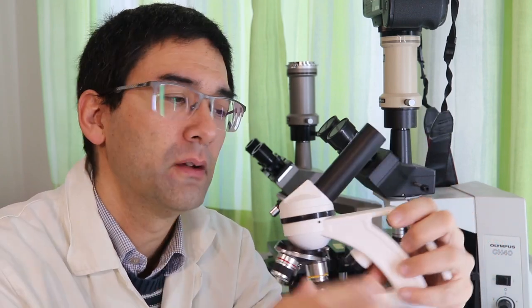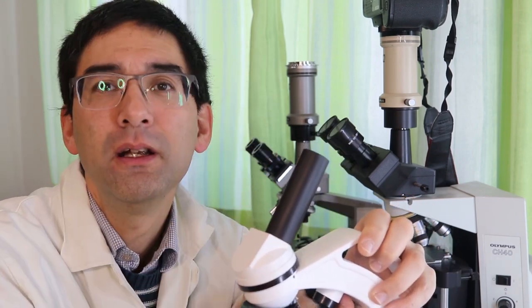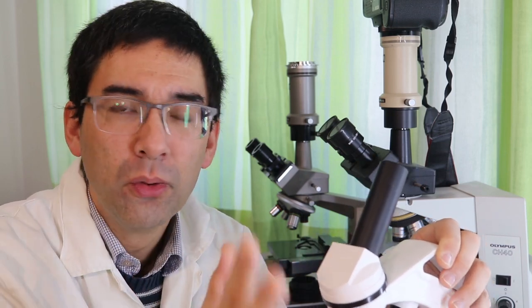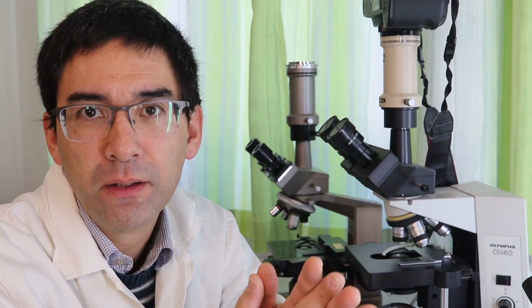And the other thing that is a little bit of a curiosity, I have to admit, is that in here, in the tube, there is a mirror, which you have already seen before. Normally, there is a prism in there. And because there is a mirror, I do not get an upside-down image like you have normally, but I get a mirror image. If I had not told you, most people would not have noticed, okay? So that's simply another thing that has to be mentioned. This might be an issue if you are actually looking at printed letters with students or children, they will appear mirrored. In a larger microscope, which is conventionally designed with prisms, it will appear upside down, but it will not be a mirror, okay?